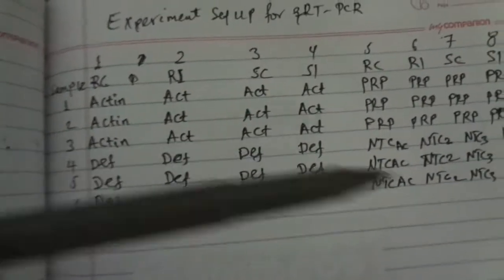So according to this, I loaded all these reactions into the 48 optical well reaction plate. As I told you, I have a total volume of 20 microliters already loaded, so each well has 20 microliters of total reaction volume.